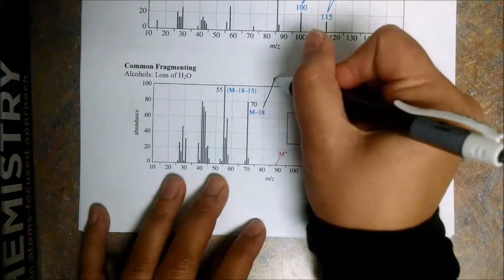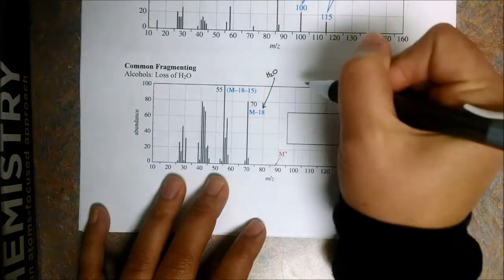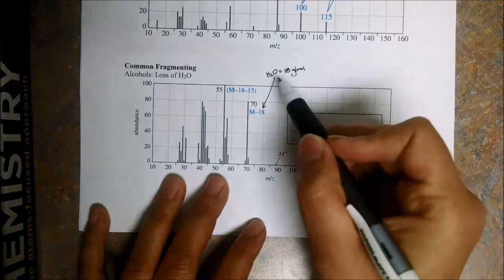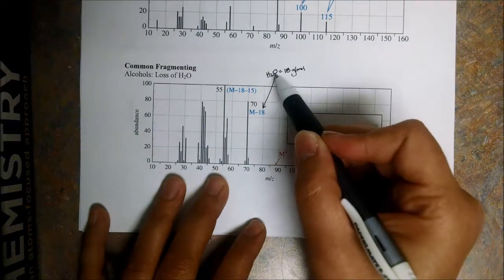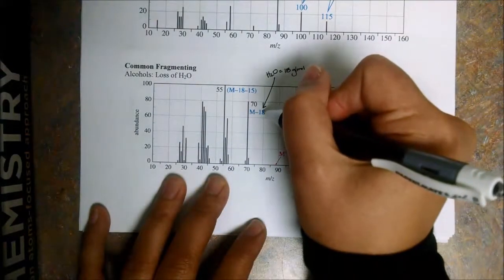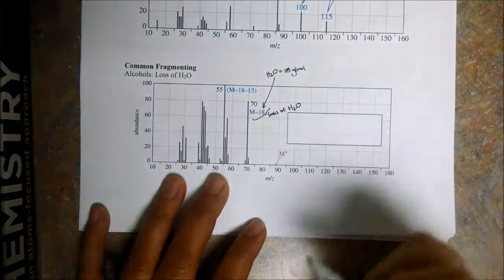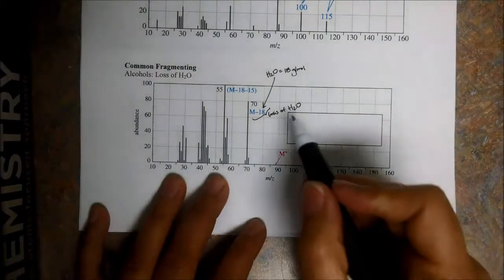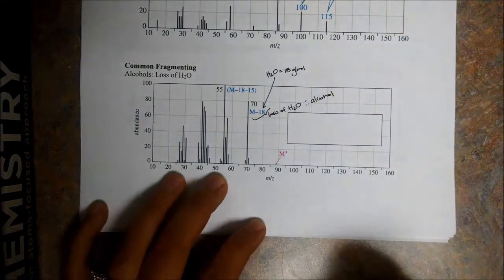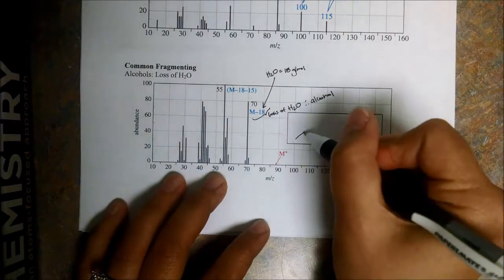Why is the number 18 so important? Because we have the loss of water, H2O, which equals 18 grams per mole. Oxygen is 16 and each hydrogen is 1, so this is 18 grams per mole. So when we lose 18, which means the loss of H2O, it means we have an alcohol, because water is what likes to fragment off of an alcohol.